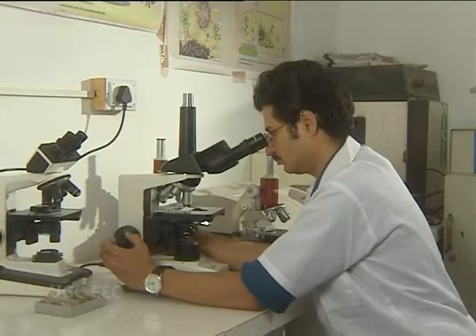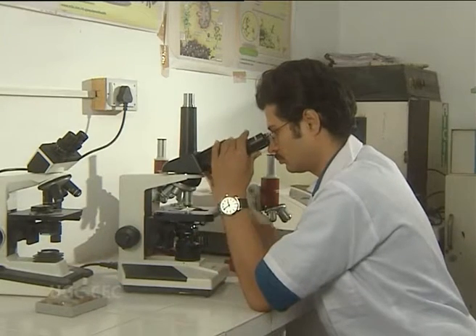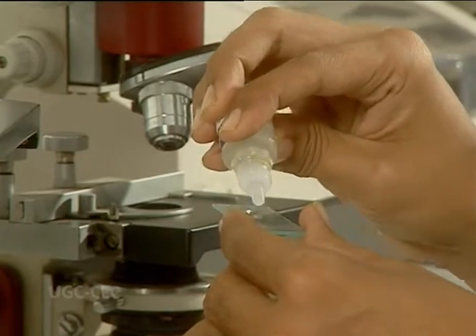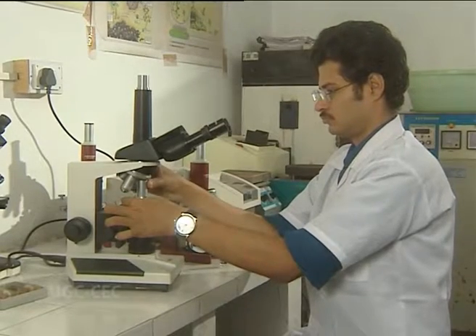Focus the image with the right eye by looking into the right eyepiece and turning the focusing knob. Focus the image with the left eye by looking into the left eyepiece and turning the diopter ring. Put 1 drop of immersion oil on the specimen. Change to the 100x objective.